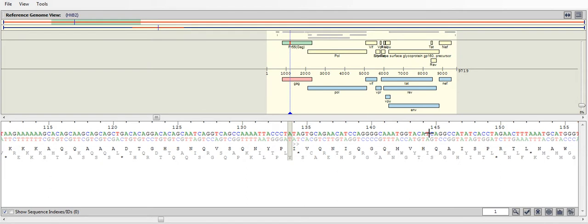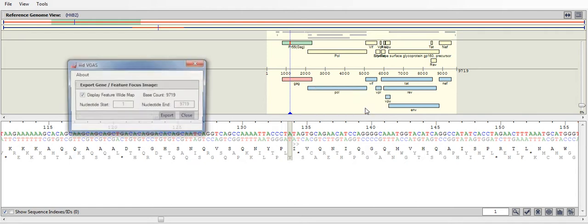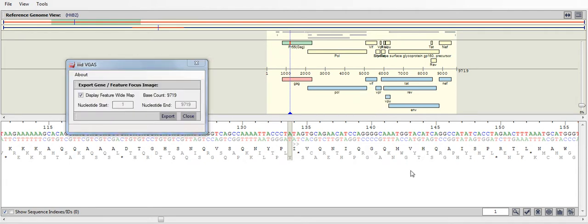We can also right-click on any of the feature bars, which will present us with various options. One being to export the image to various image types. We can generate an image in various formats for the full reference genome or for a required region. The scale of the image will match the current scale displayed, which can be altered by the trackbar.